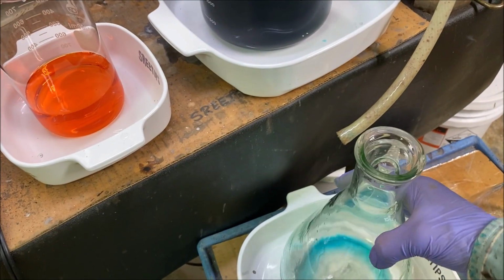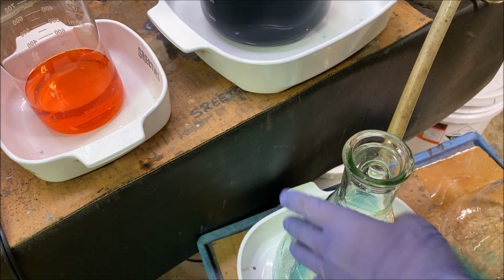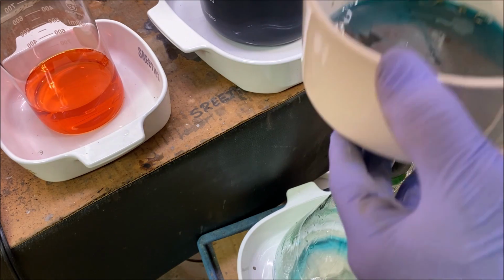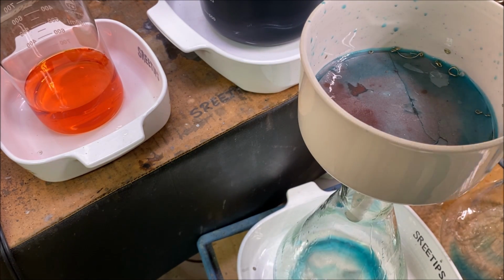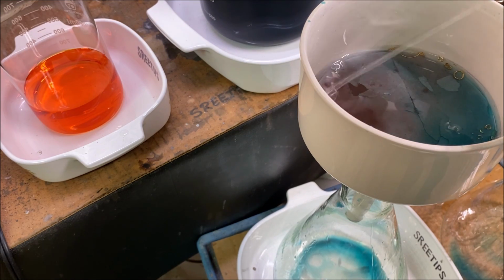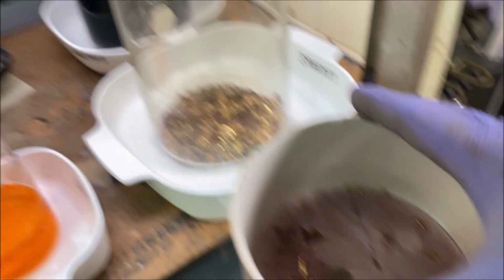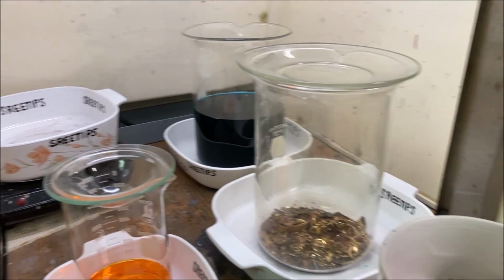Hook this back up to our vacuum, and we'll continue to pull this liquid through the filter. Get everything rinsed down out of here. I've got all the solution pulled through the filter. There's our solution back here. It's going to have some silver in it.